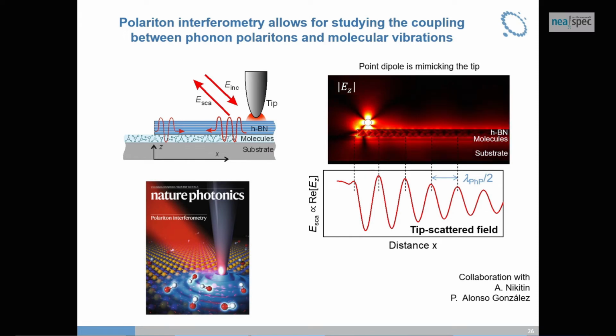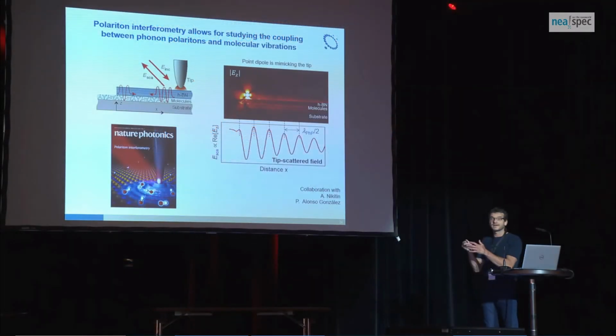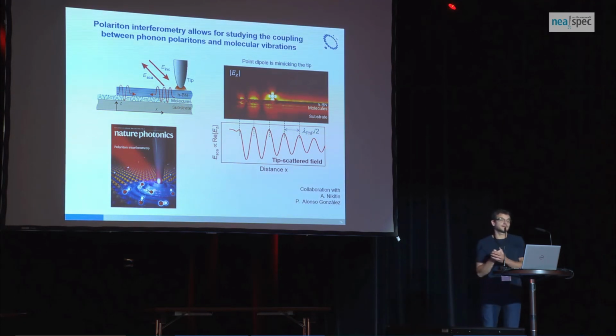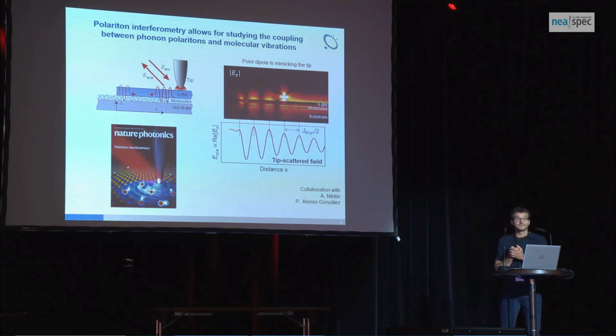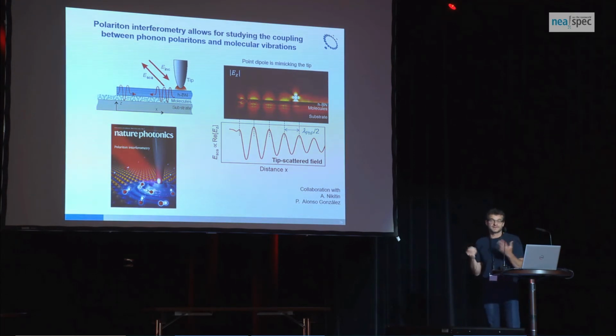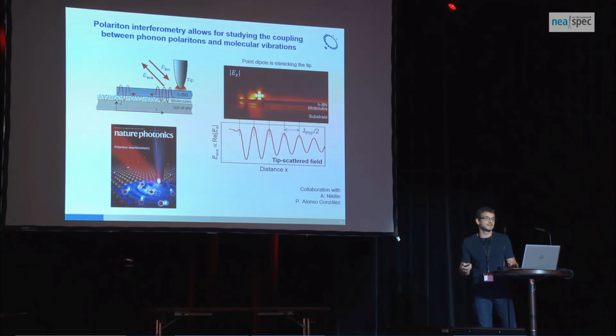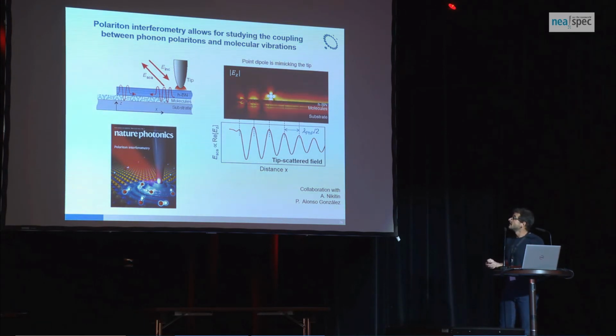I think you have really many talks on these polaritons, so I jumped directly into the work that we did. We were interested in how these phonon polaritons that propagate in an hBN slab interact with molecular vibrations. Why that? Because these modes are so highly confined that there may be a very strong light-matter interaction. Strong light-matter interaction in the mid-infrared has attracted a lot of interest recently because it was reported by Thomas Ebbesen's group, among others, that this strong light-matter interaction with molecular vibrations eventually can change chemical reactivity rates and landscapes. So it's fundamental work here.